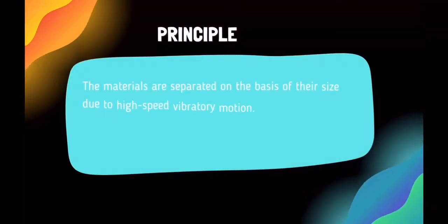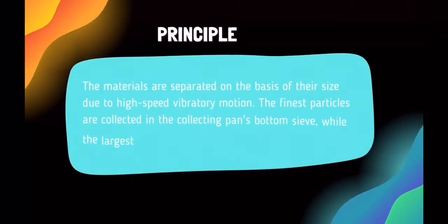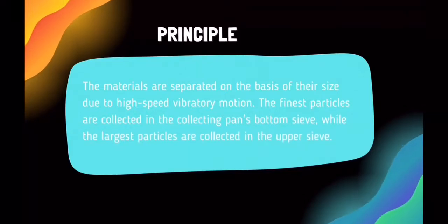Next is principle. The materials are separated on the basis of their size due to high-speed vibratory motion. The finest particles are collected in the collecting pan's bottom sieve, while the largest particles are collected in the upper sieve.